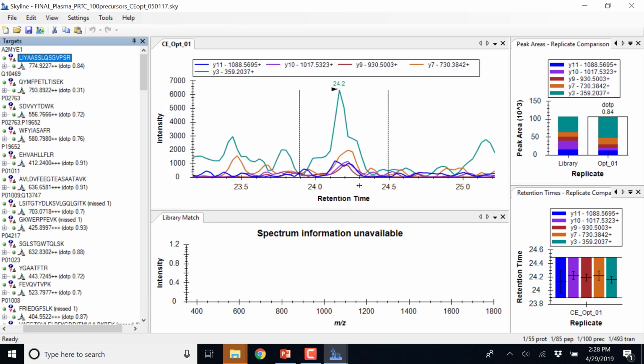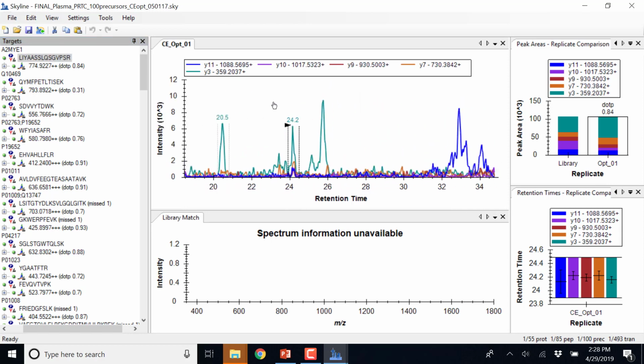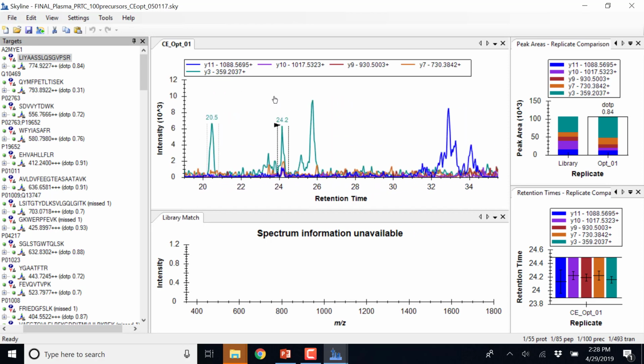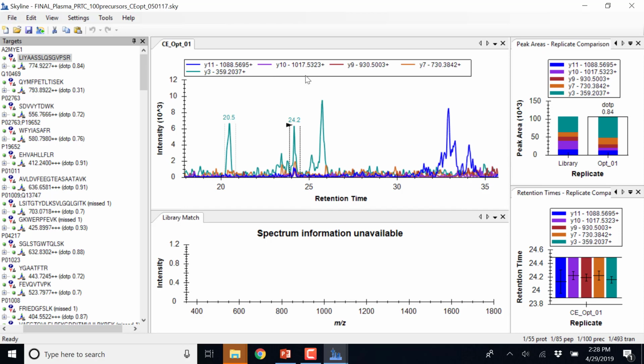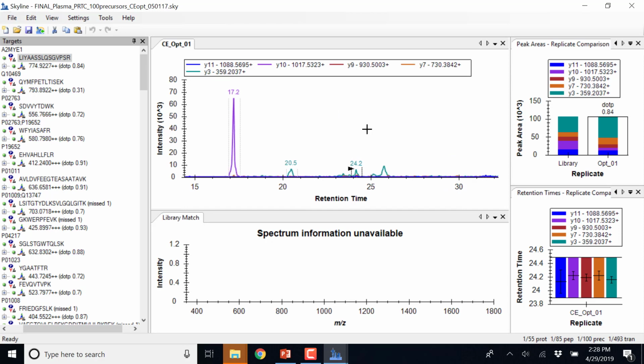So when I zoom in with F11 and I'm like, hey, I don't think that peptide looks very good. If you have a little roller ball on your mouse and you put the crosshairs in the chromatogram, you hit Control and then roll down, you can kind of quickly move things back and forth. If you click and hold and move it left and right, it changes the x-axis. Right now, this is auto-scaled to the most intense peak in the chromatogram. But this, for me, just helps if I want to look around and find any other peptide.